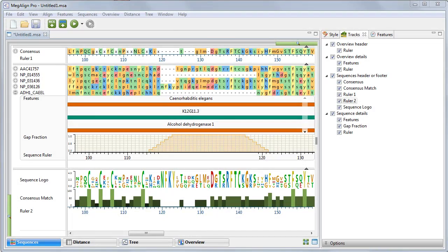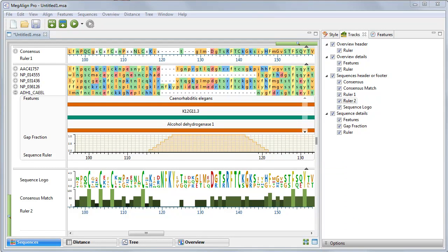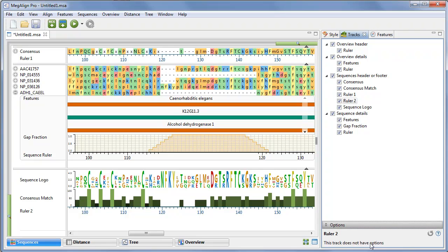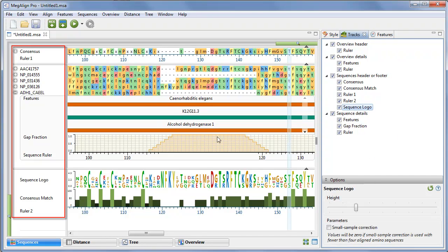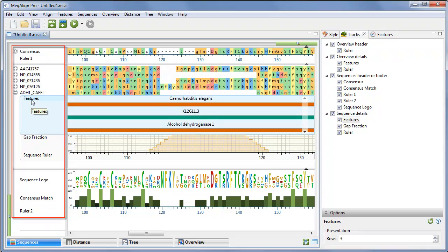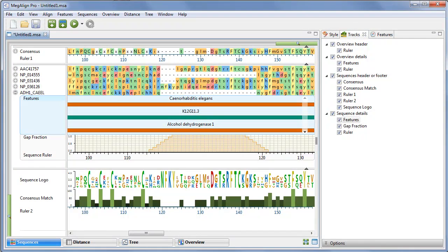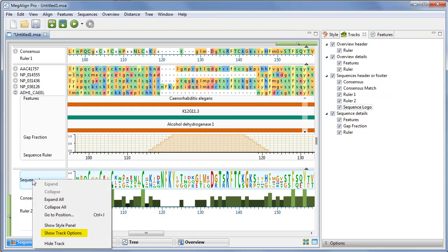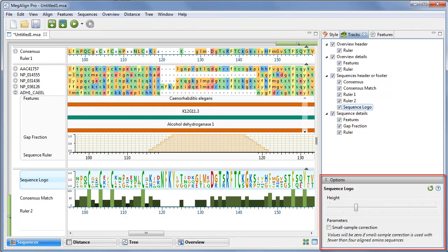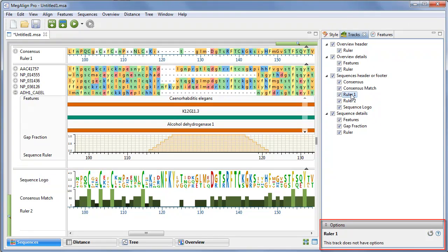Editing of track parameters is handled through the Options bar located at the bottom of the Tracks panel. To open the Options bar for a particular track type, click on the Expand bar labeled Options, and then select the type of track from either the Tracks panel or from the Sequences view or the Overview. Alternatively, you can right-click on a track in one of the views and choose Show Track Options. Note that some tracks, in particular the rulers, do not have any options.